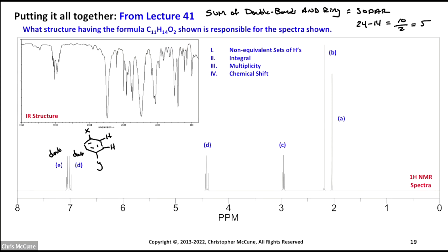I've got an IR structure. So maybe that's an ester. I have 2 oxygens. I don't have a carboxylic acid. I don't have an alcohol. I can't see that in the IR. And I just basically have a bunch of boring CHs otherwise, right?